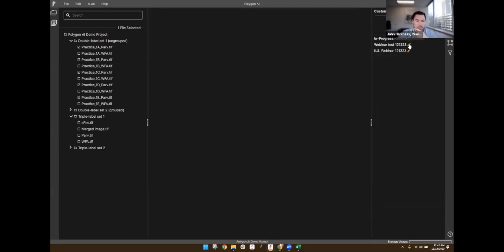But great question. These are definitely just in progress because I haven't submitted them and they haven't trained. They'll show up in a different sub list here if I actually had models trained in this account. And those would be your official ones. You can delete these really easily too.